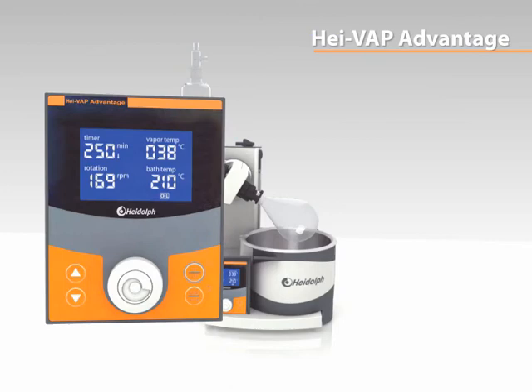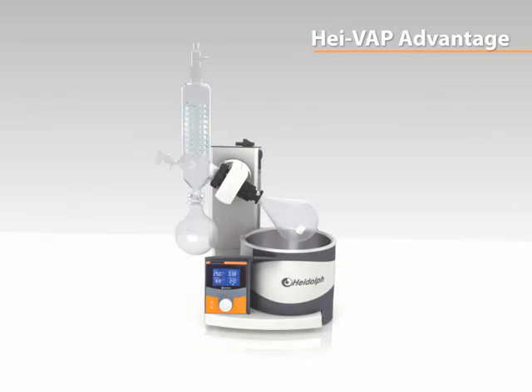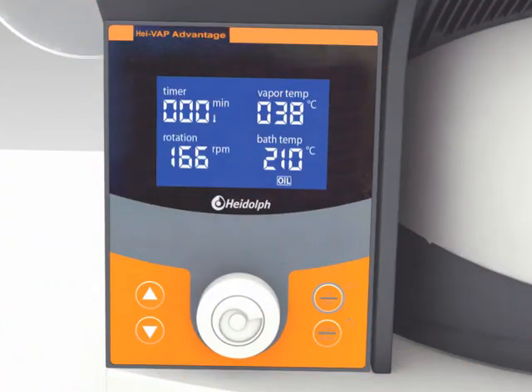Upgrade your Hei-VAP Advantage at any time in the future to a Hei-VAP Precision model with an easy to use upgrade kit. The Hei-Guide control knob allows for easy navigation of settings and confirming all parameters.